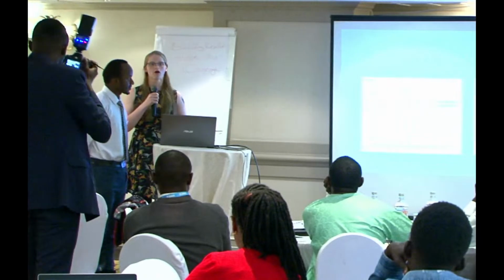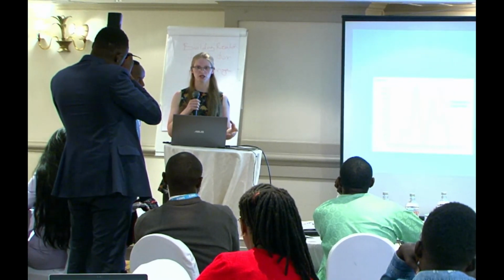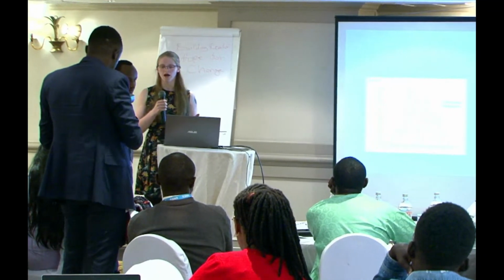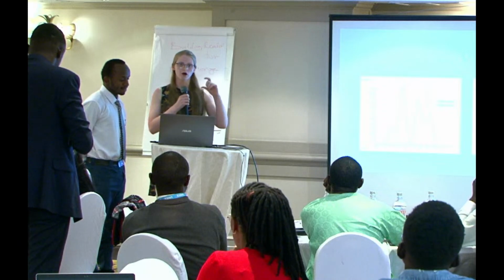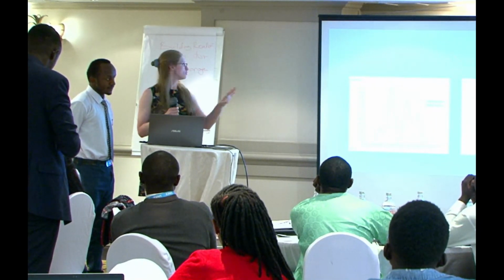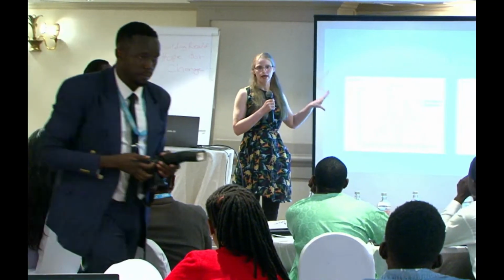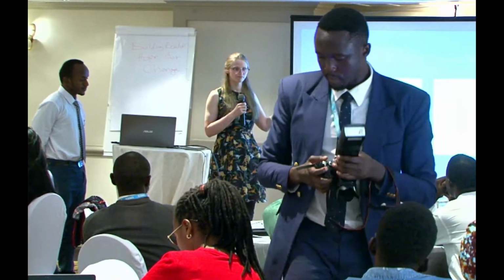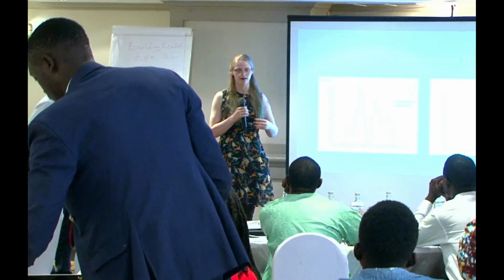Now, we weighted our LC analysis a little bit less heavily in our discussion, and you might ask why was that? Because our LC didn't turn out as well as we wanted it to. Our expected compounds were very, very small in concentration, and you can see we had to zoom in to picture it. For this reason, and also because everything we found was already in our molecular library, not that interesting, I'm going to speed through a little bit.